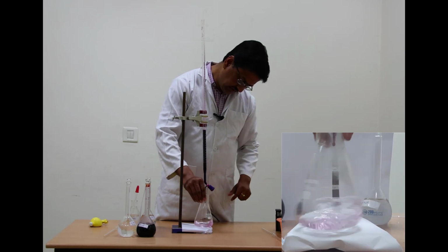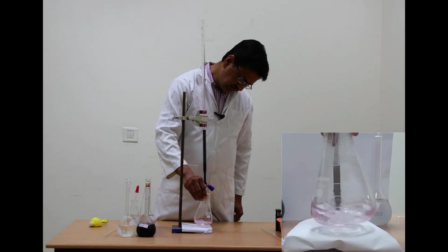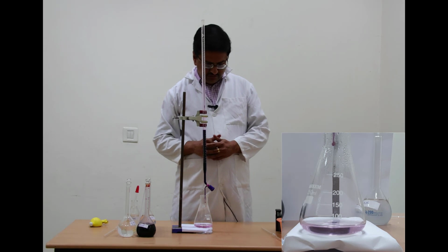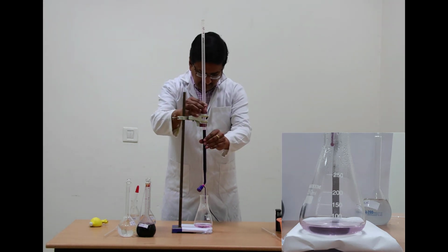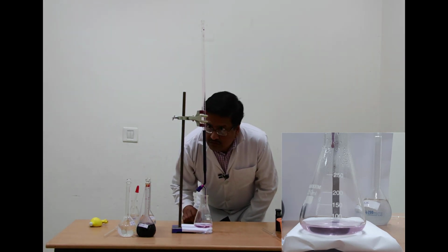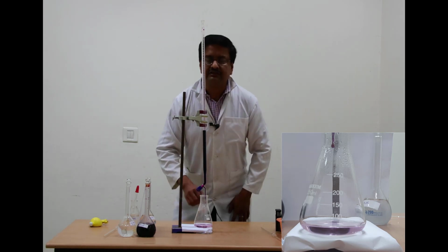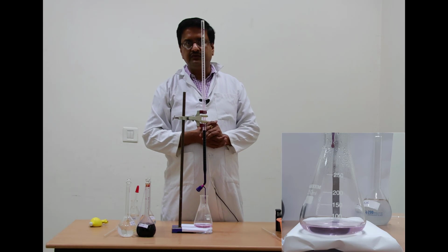See this. Again, with one drop, the color persists, and this is the end point of this titration. So once again, let us see what the burette reading is, and then you note it down and use it for your calculation. The reading is 36.4. So we started from 24.1. That means it has taken 12.3 ml.